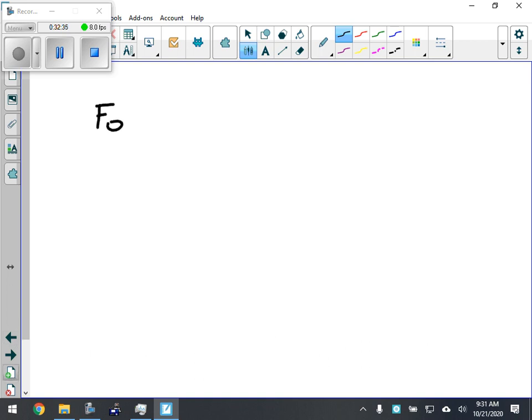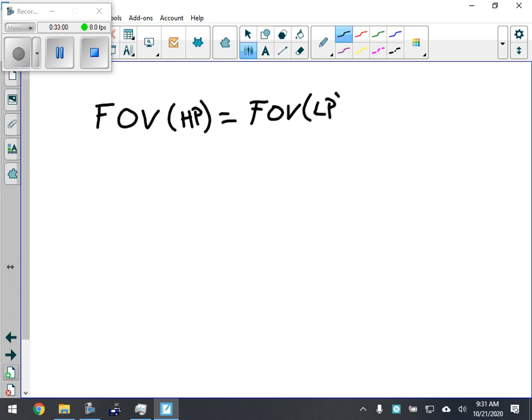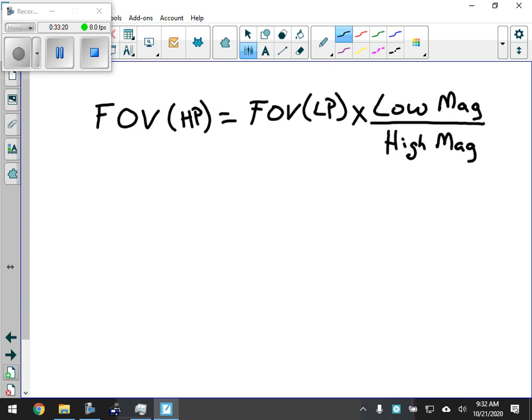The formula looks like this. The field of view, and by the way, I'm just going to abbreviate this, and we're going to talk about high power, okay? So HP. Not the sauce, that's different. Is equal to the field of view on low power times, and I know this looks a little crazy, but I'll explain what's going on here, times the low magnification over the high magnification. Okay.